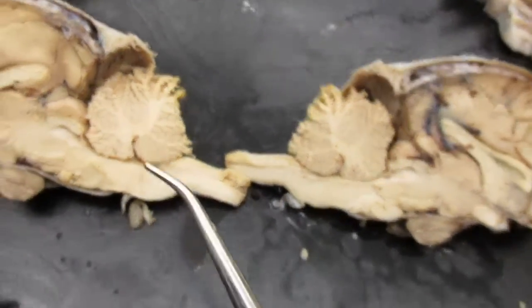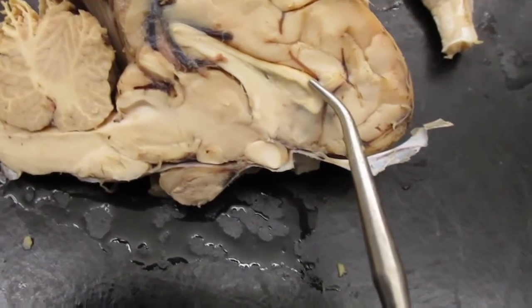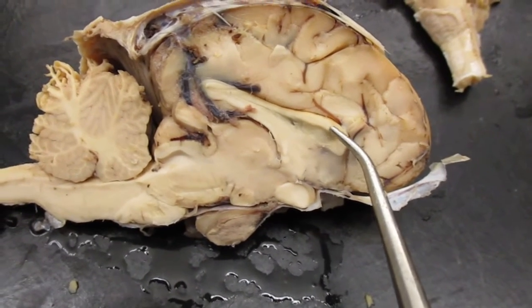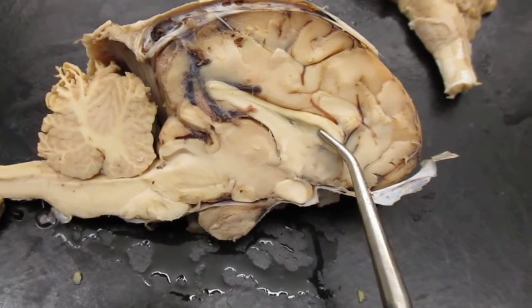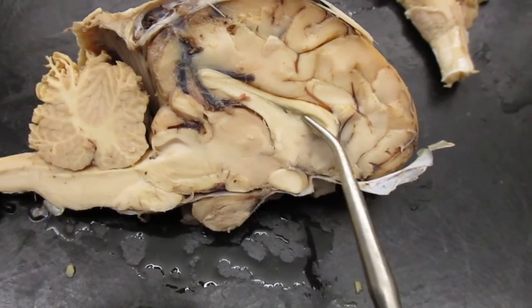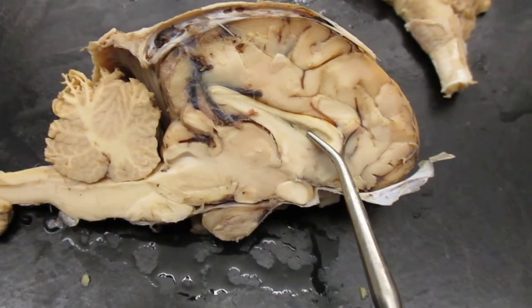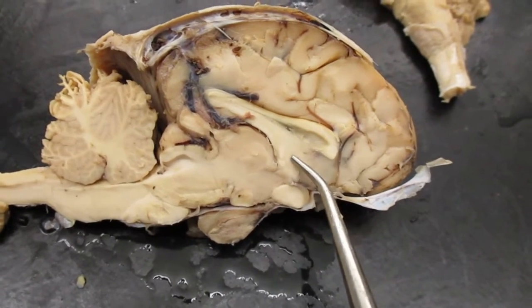Okay? Let's talk about the corpus callosum. Here's your corpus callosum right here. Here's your septum pellucidum, or clear septum. The clear septum is a membrane that separates your lateral ventricles. And the fornix is right here. Corpus callosum, clear septum or septum pellucidum, and then your fornix.